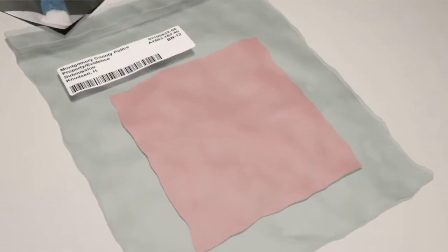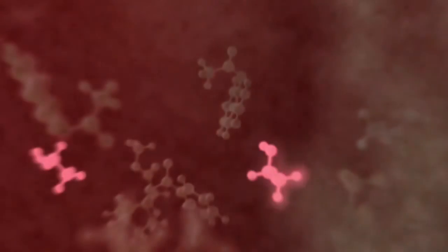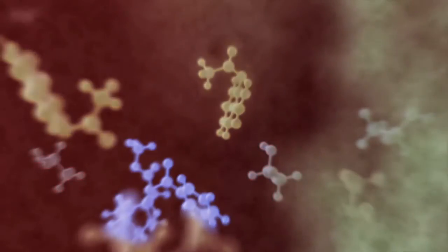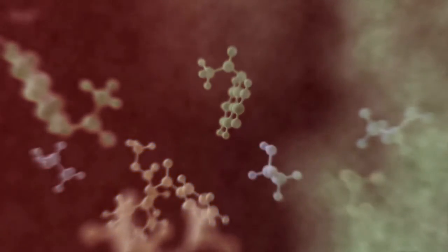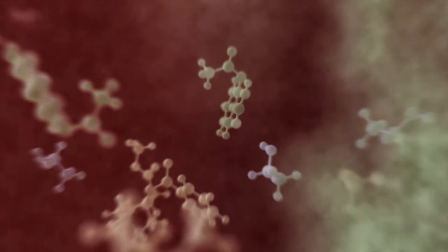Gas chromatography determines how many chemicals are present in a sample and separates each compound for further study. It works like this.